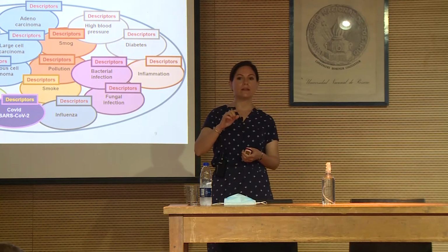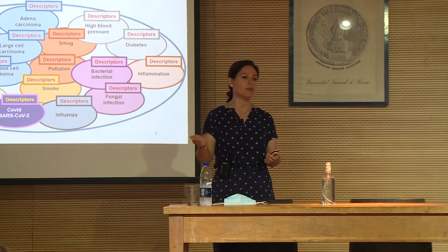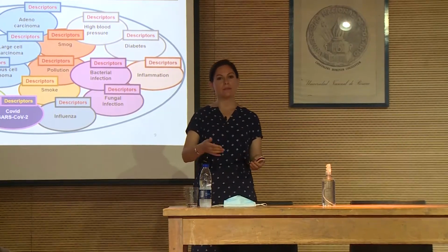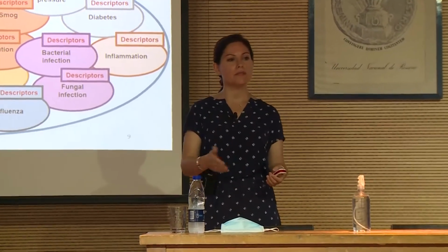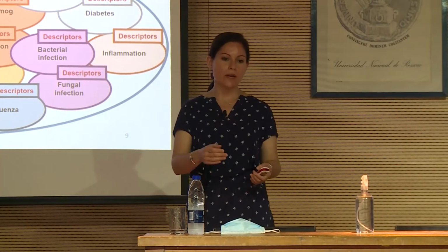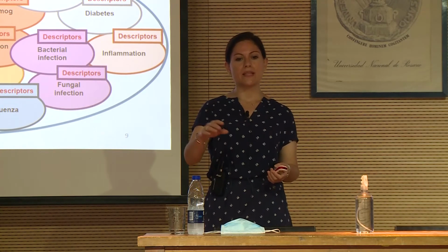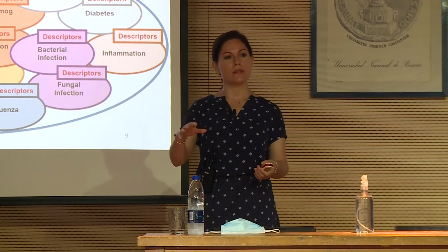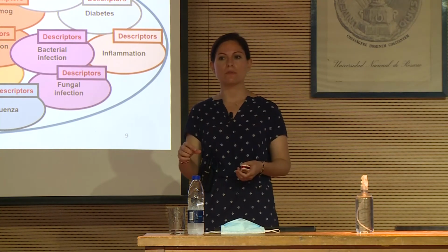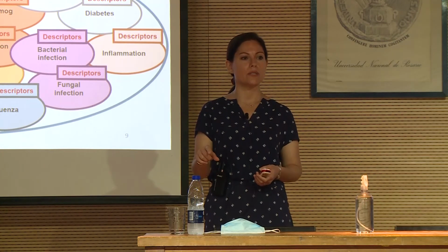But I don't know, when I started proteomics 10 years ago, you could publish your results. They did proteomics, you could publish. But then in the meanwhile, you cannot publish if you don't upload the results. And then now you have the results, but it's not clear what was there. But in the newest projects, the metadata is more complete. You even have the outputs of MaxQuant or whatever software you use uploaded.